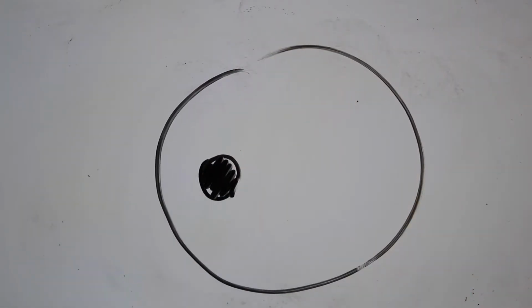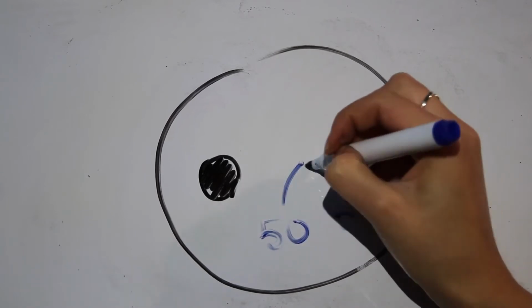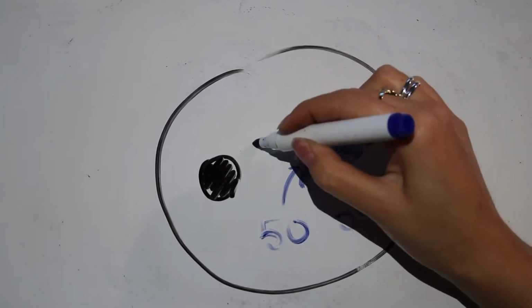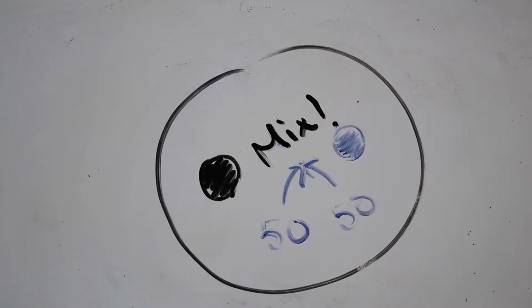Obtain both possible samples from your demonstrator. You'll now need to make some mixtures. You can make a mixture by crushing together small and equal amounts of the two compounds on a clean and dry watch glass.